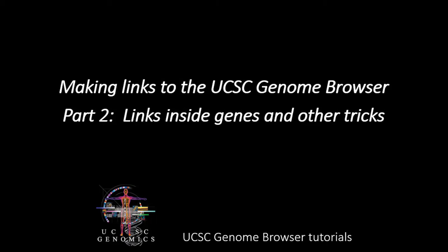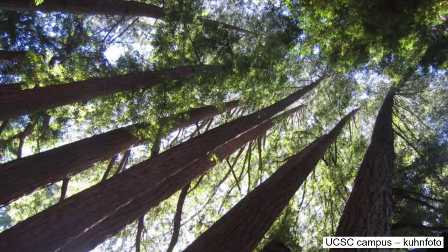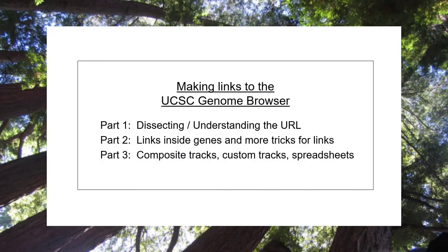Welcome to Part 2 of the video series showing how to make links to the UCSC Genome Browser. In the first installment of this series, we saw how to pick apart the UCSC browser URL, how to turn on specific tracks of interest and control their visibility level, how to hide undesired tracks, and how to navigate to locations in the genome using gene names or dbSNP identifiers.